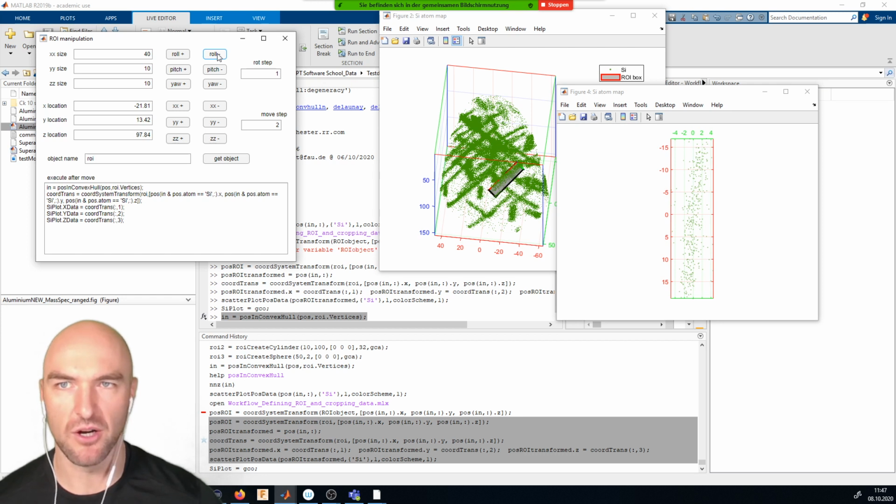So obviously this always takes a little bit of time to execute. And one of the biggest reasons for that is that I'm using a data set with 20 million atoms, right? If you use a smaller data set, then it doesn't take as long as it does here. Oh, and I think I'm going in the wrong direction. Yeah, I was going the wrong way. My bad. If you do that on a significantly smaller data set, then everything executes much faster, obviously.